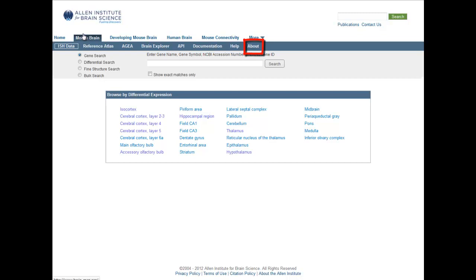But we will get started with the search features on the ISH Data tab. If you know the gene you would like to find expression information for, type the gene name or identifier in the text box and click Search.